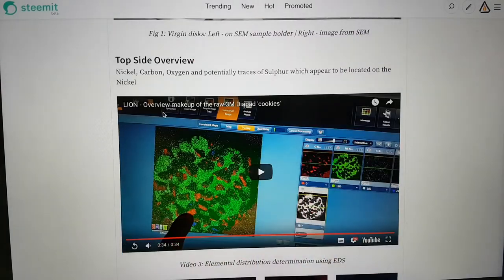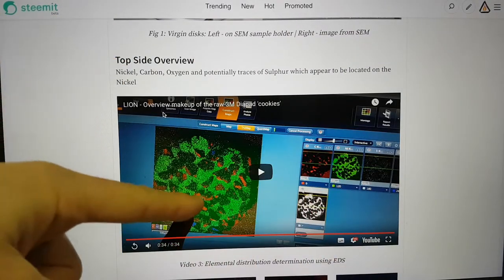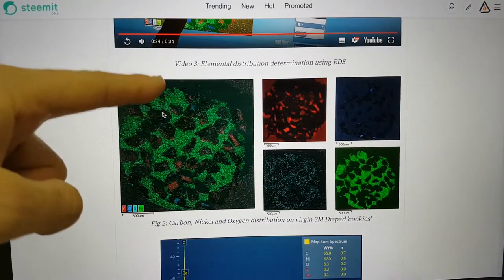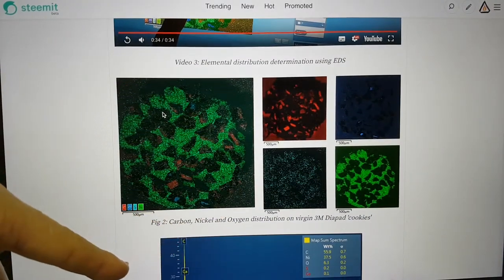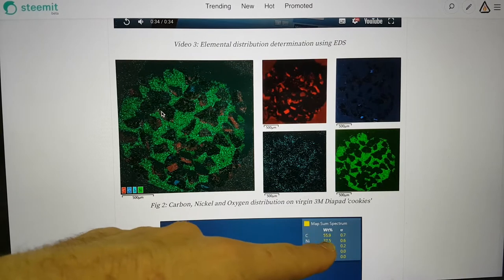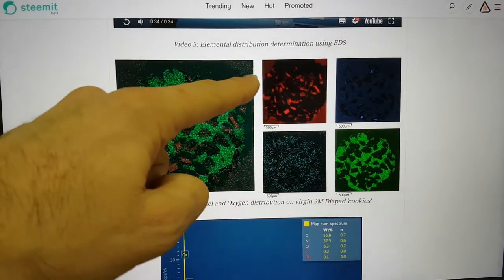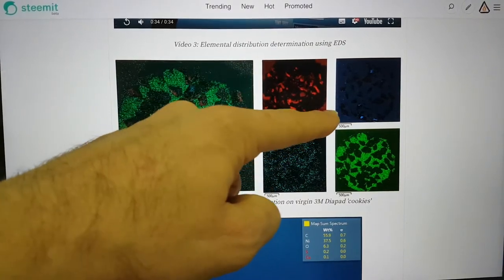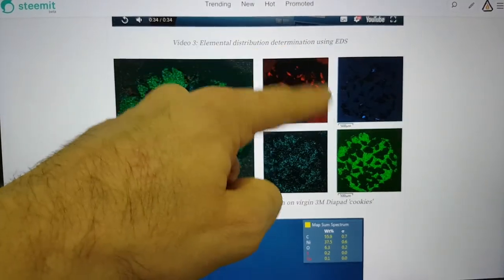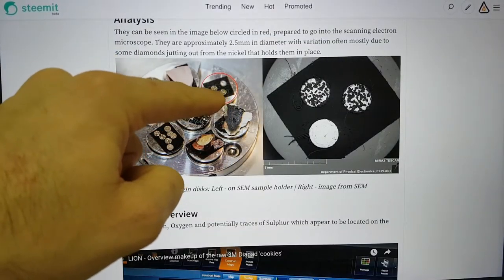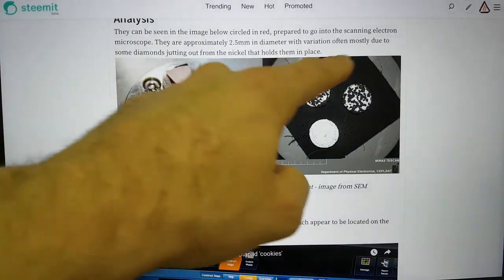Looking at the top side there's an overview video here. Here is the element distributions and essentially by weight it is carbon, nickel and oxygen. There's an over-representation of carbon here because it's looking at the carbon in the SEM carbon tape that adheres the sample to the background.